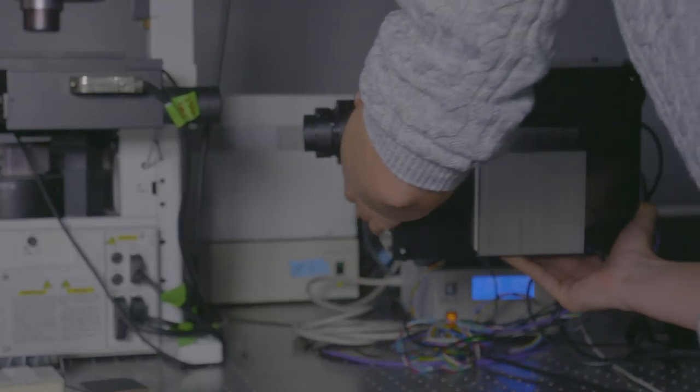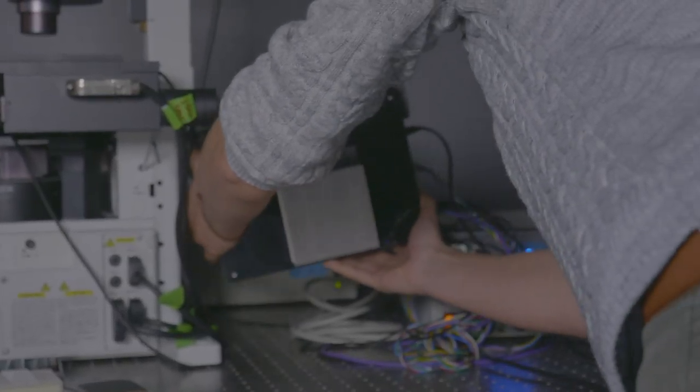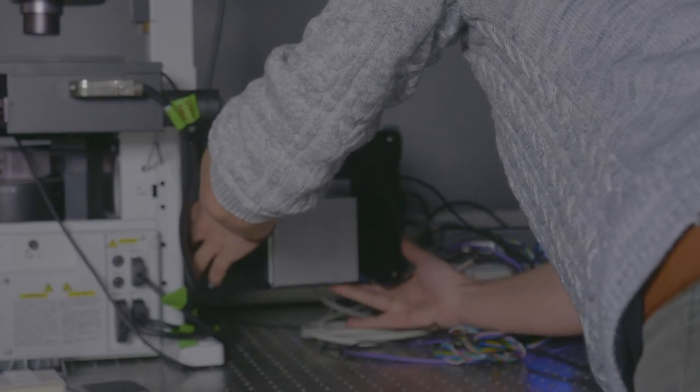I am a first-year PhD student at the laboratory of bio and nano instrumentation and I develop microscopes to look at biological samples with high resolution.